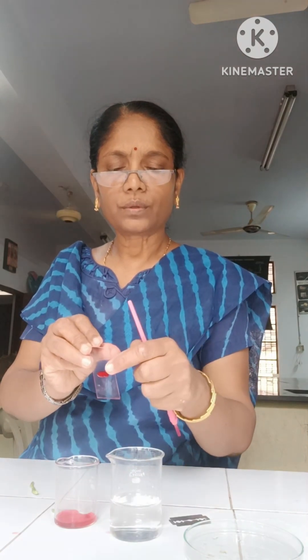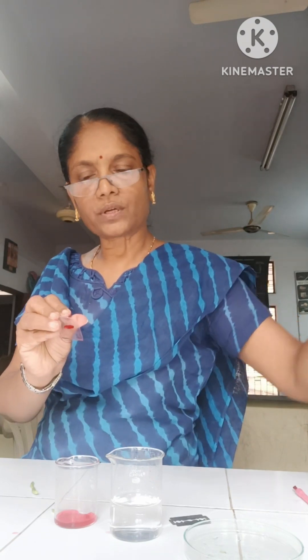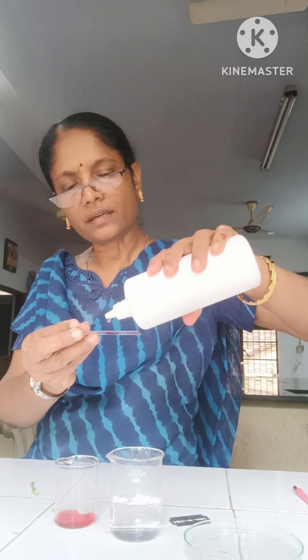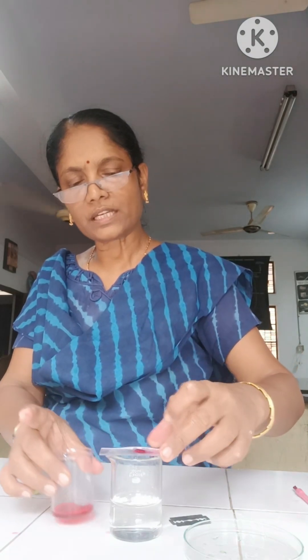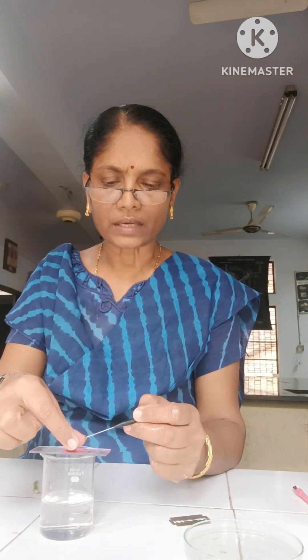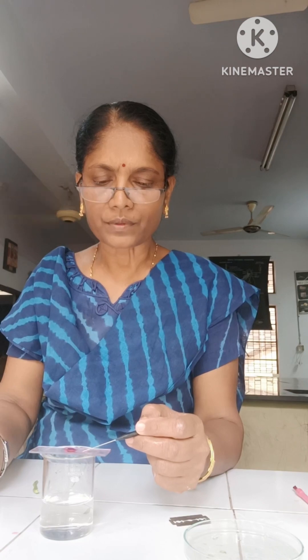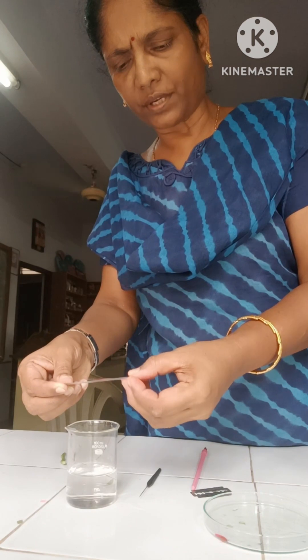Now the cutting is ready. We can add some glycerine upon the cutting — it prevents from drying. I have added one drop of glycerine. Now we can put the cover slip. You have to hold the cover slip between your index finger and thumb finger and slowly put the cover slip — use the needle to place it. The excess glycerine can be absorbed with the help of blotting paper.